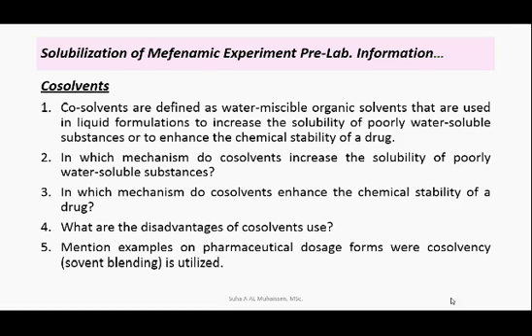This would be significant, for example, in a formulation problem where it might be necessary to increase the solubility of a drug 500-fold or more. The use of co-solvents to prepare solutions of non-polar drugs is a simple and potentially effective way to achieve high concentration of drug.